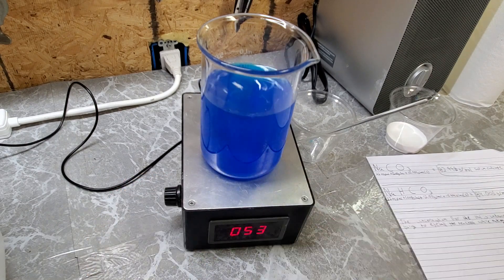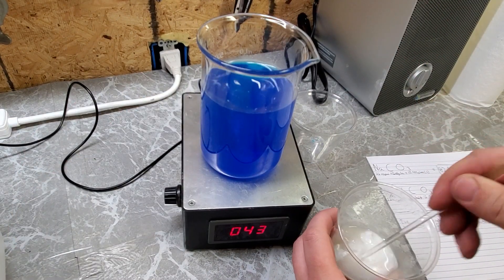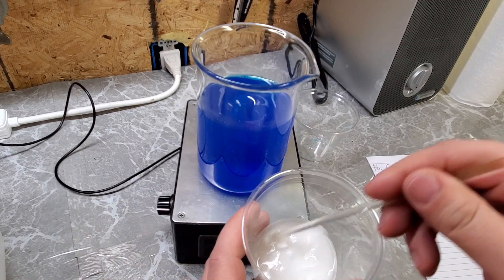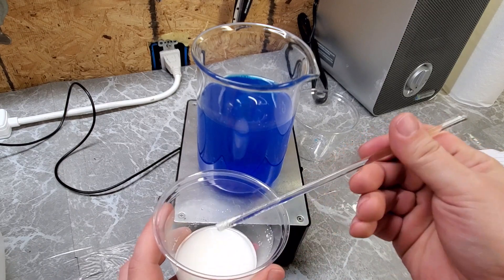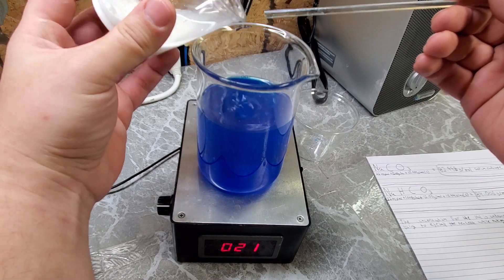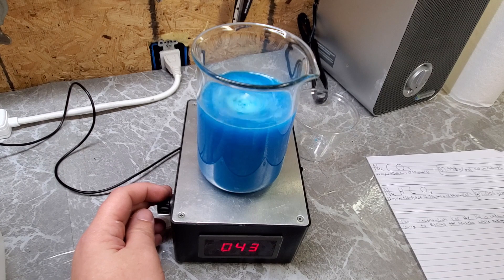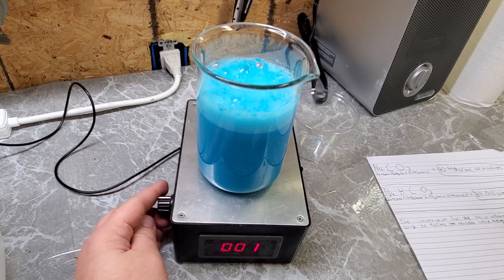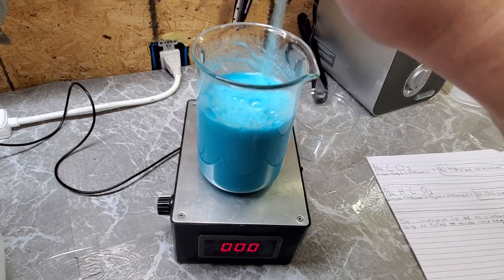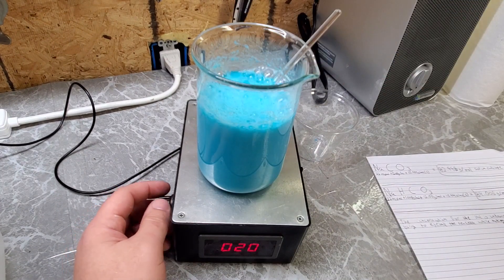Once a majority of the copper sulfate is dissolved, our next step is to add in sodium carbonate. We're using sodium carbonate purchased as pool pH increaser, but you could also use baking soda or sodium bicarbonate in this reaction. I recommend just adding it into the copper solution as a dry powder. You can see a light blue precipitate fall out of solution — this is basic copper carbonate. Copper sulfate reacts with sodium carbonate in a double displacement reaction, yielding copper carbonate and sodium sulfate, while giving off quite a bit of carbon dioxide gas. Add the sodium carbonate in slowly to prevent the beaker from bubbling over.